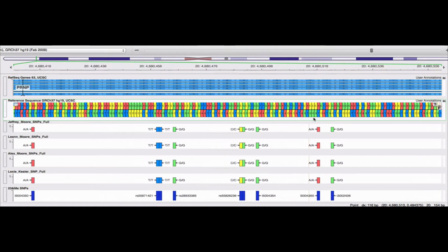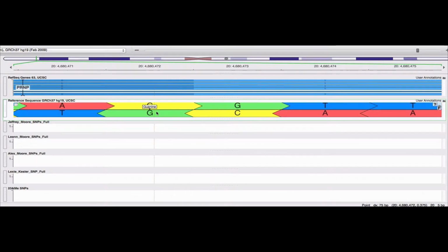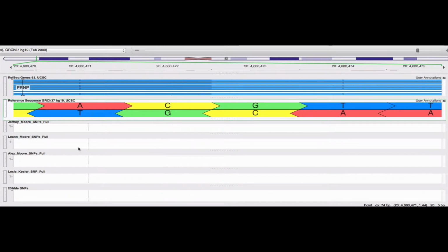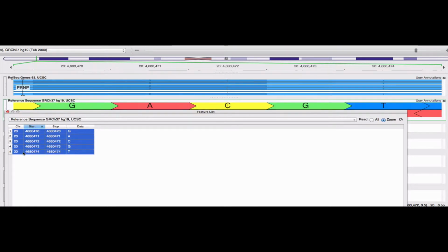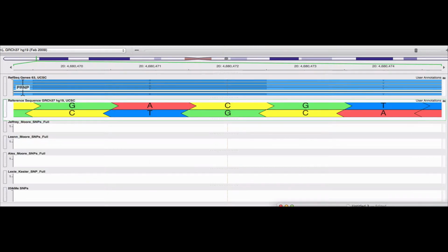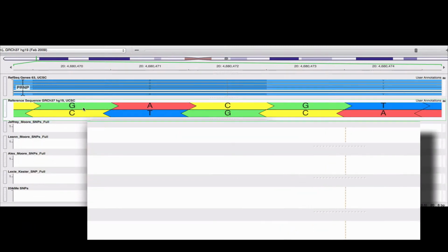You're going to notice that the sequence has an orientation to it. The top band, ACGT, from left to right is 5' on the left, 3' on the right. Let's actually copy that sequence onto the clipboard. So go ahead and copy the sequence, place it on a clipboard. Let's paste that into a text editor so that we can verify that indeed we've got the GACGT sequence.